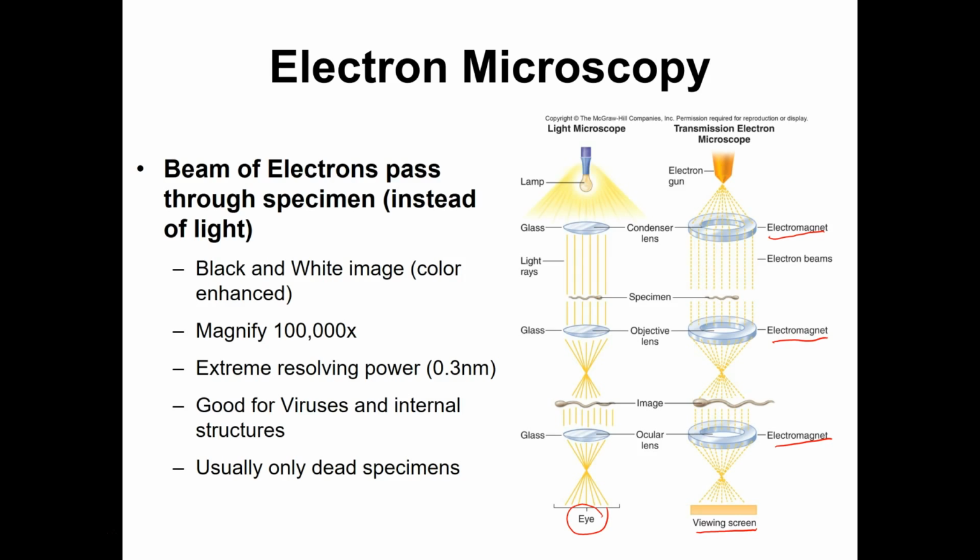So, some other interesting things about electron microscopes. Electron microscopes only produce black and white images. And some of you may have seen just beautifully colored electron microscope images. I have bad news. It's all done with Photoshop after the fact. They're given high contrast colors so that you can see different objects within the image. And I'll show you examples here in a second.